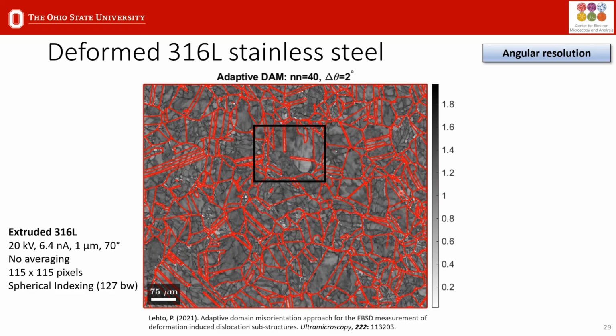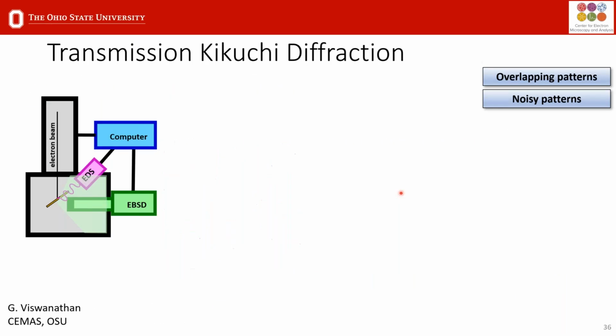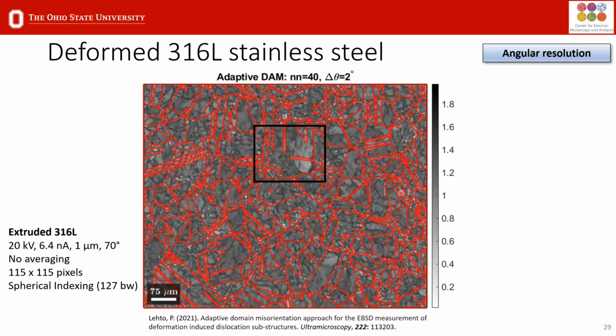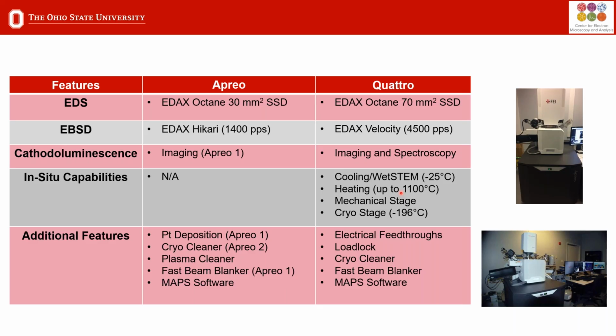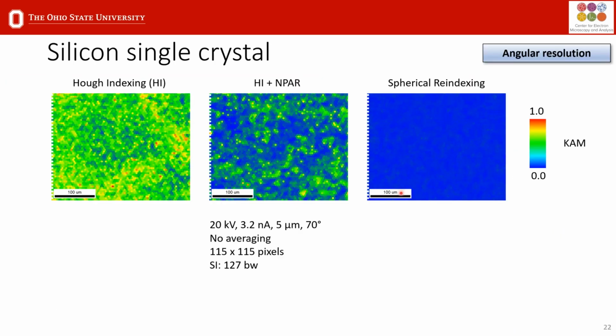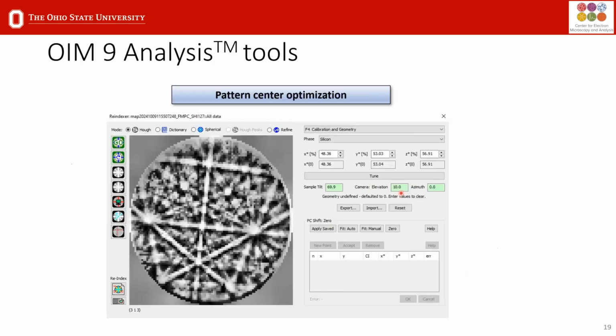And then one last question we have is, when would we use 45 degrees in the EBSD technique? I'm not sure exactly how that goes, if that's relative to your TKD slide. No, that's fine. Let me just get to one of the images now.